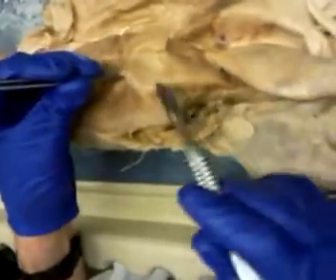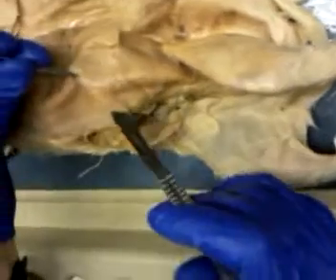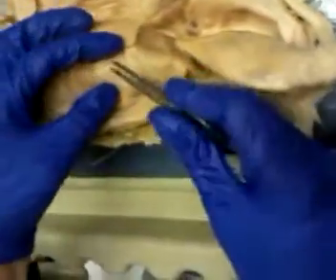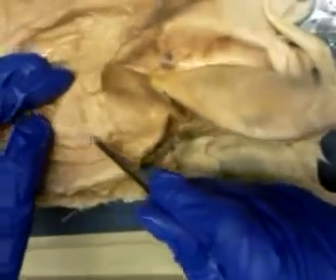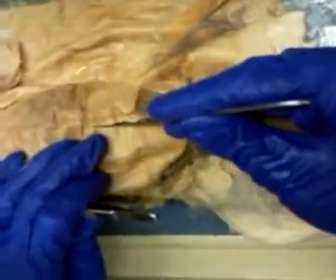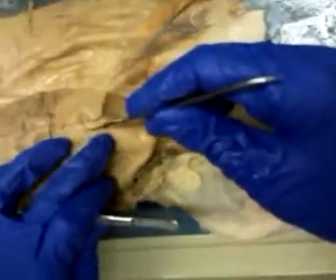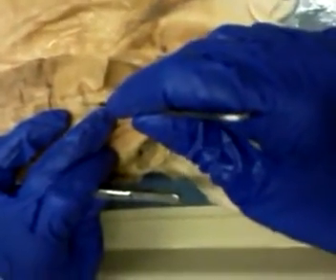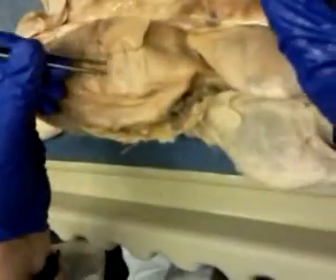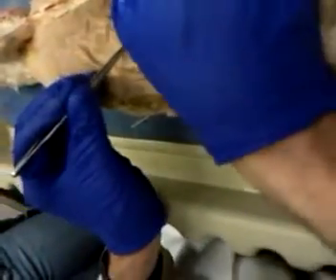And if I lift this off, that's not going through that layer, but not happy with that. The other thing I'm wondering is this layer maybe stops right there, and that seems to be a different fiber direction. So maybe I'll go in at the top and come down. That might be better. Yeah, I'm cutting through meat, I can see that. Really need a sharp scalpel for this. Okay, got it, I think.